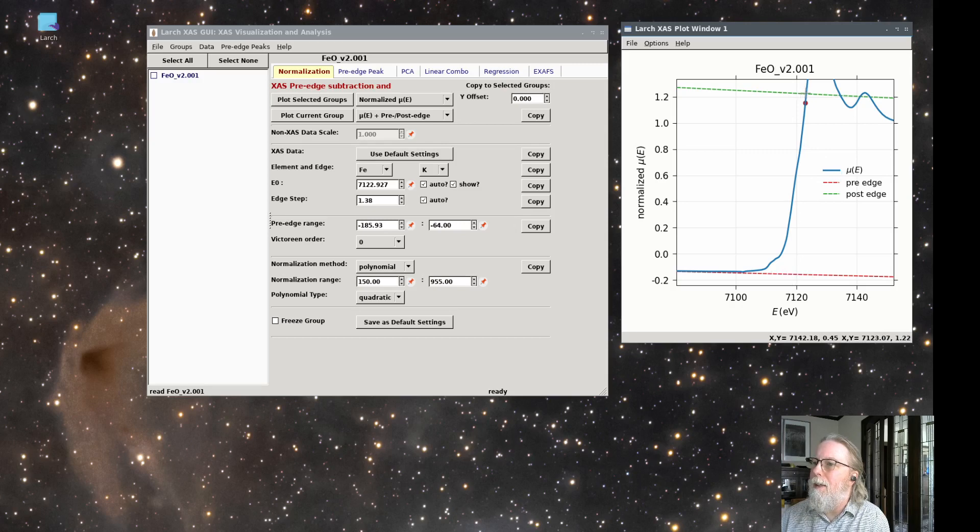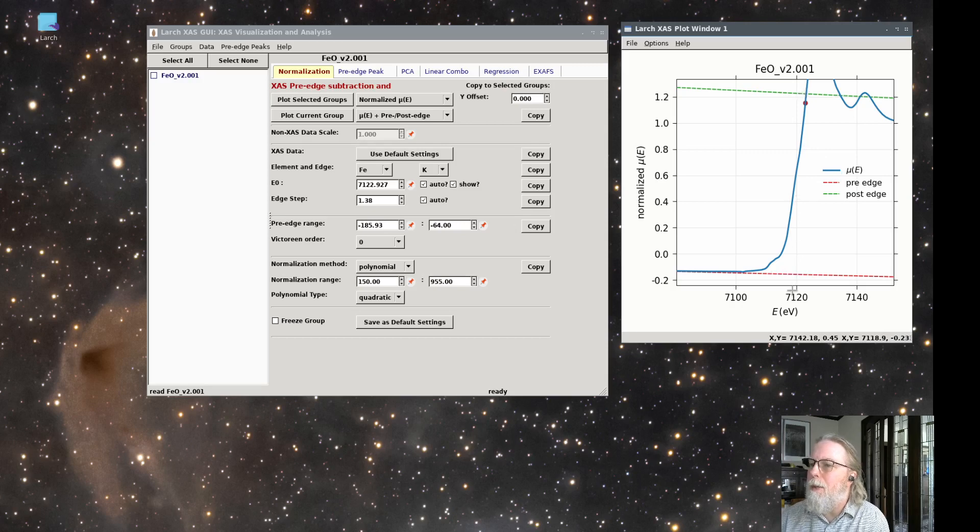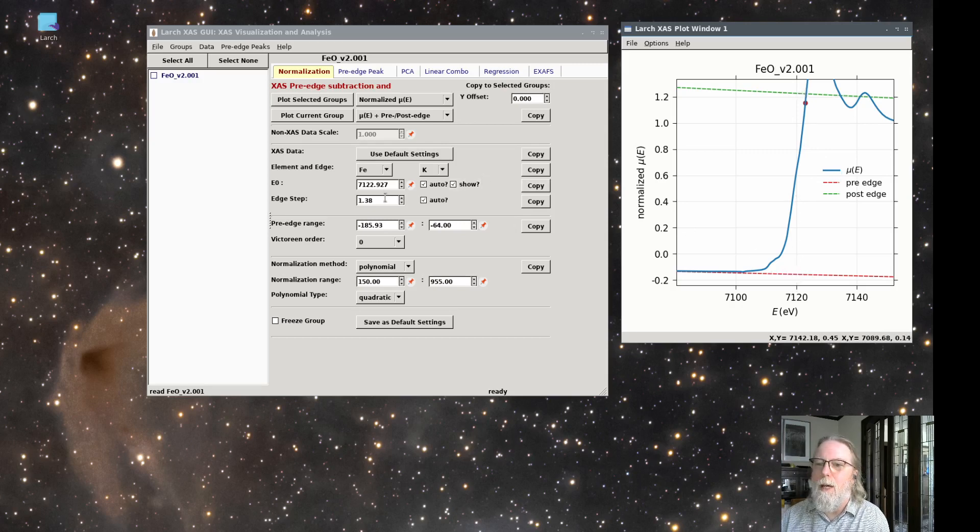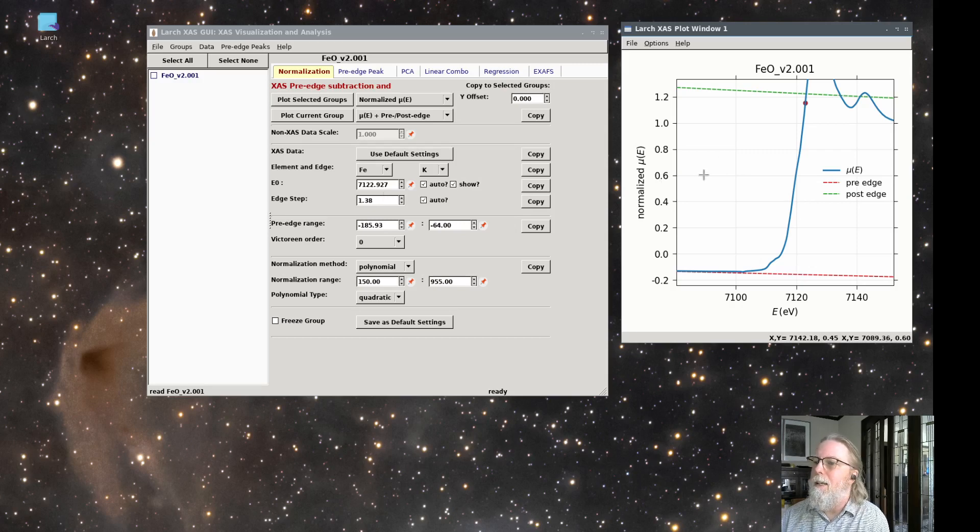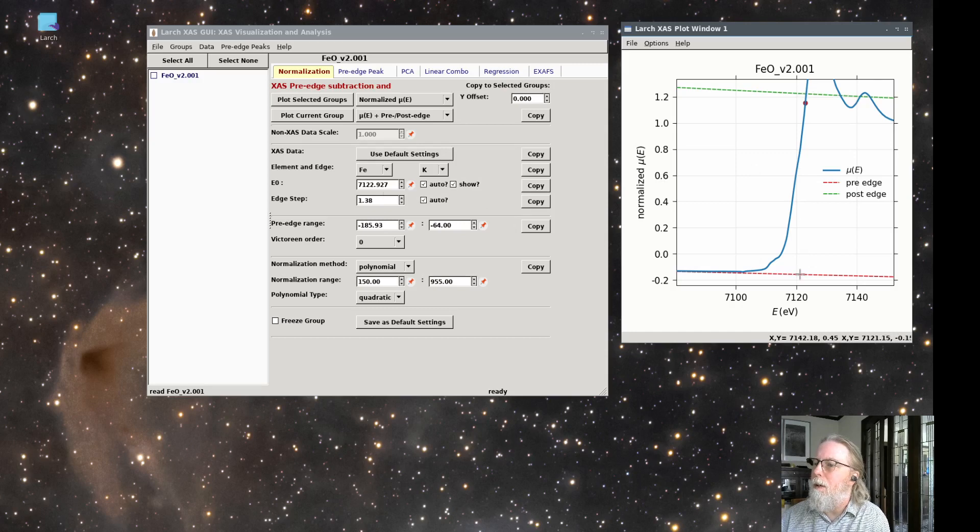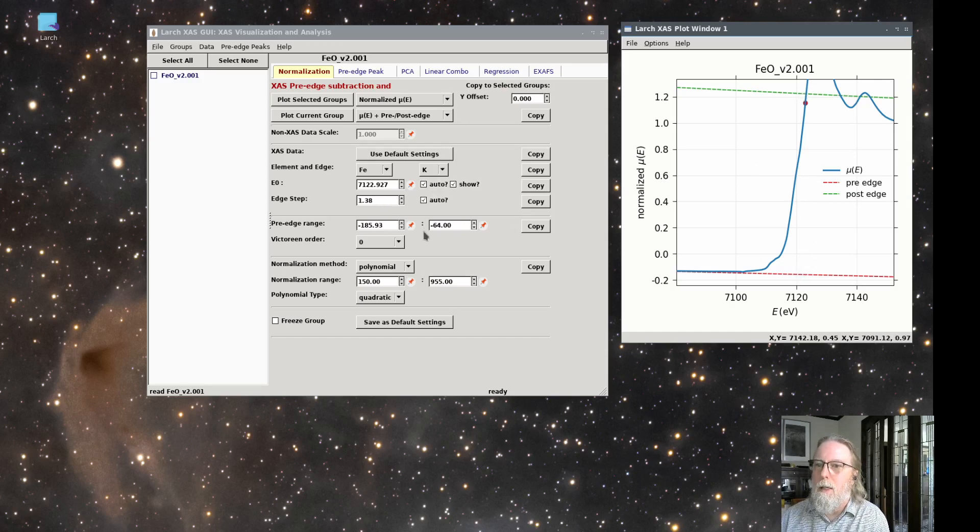So that's like something like 1.2 something, and that's like minus 1.5 or something. So that gives 1.38 as the edge step. It's the difference between the green curve and the red curve at E0 is how it determines the edge step.